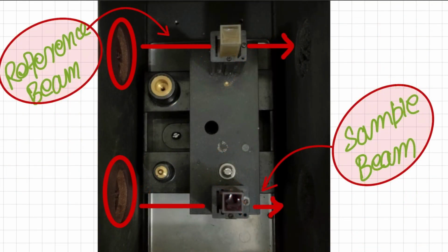Here in this slide you will see that we have placed the reference cuvette at this position and our sample at this position, and for this current experiment we are using KMnO4 in order to find the unknown concentration, and therefore we will also make standard solutions of KMnO4. From these holes light is coming from left to right, and in this position detectors have been placed. These detectors detect the light which reaches the detector after a particular absorbance.